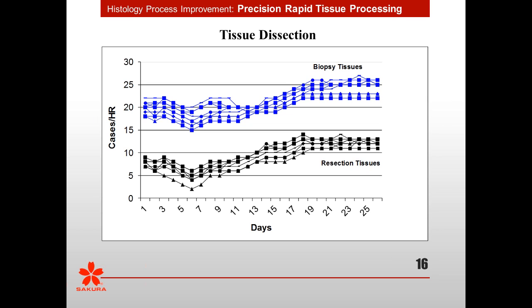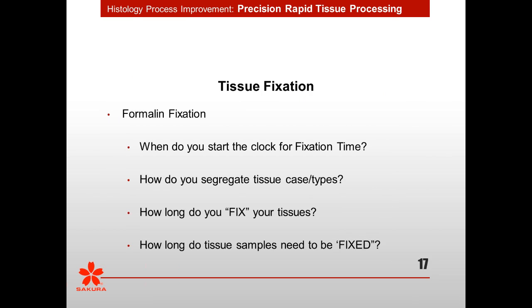And on the top, in the blue, these are more of what we will call the small biopsy diagnostic tissues, that there's a dip, and then eventually everybody moved up into a higher rate of productivity, all becoming comfortable with the process and the new tools that you're going to be using. And I would think that in most labs you'll see a similar type of learning process.